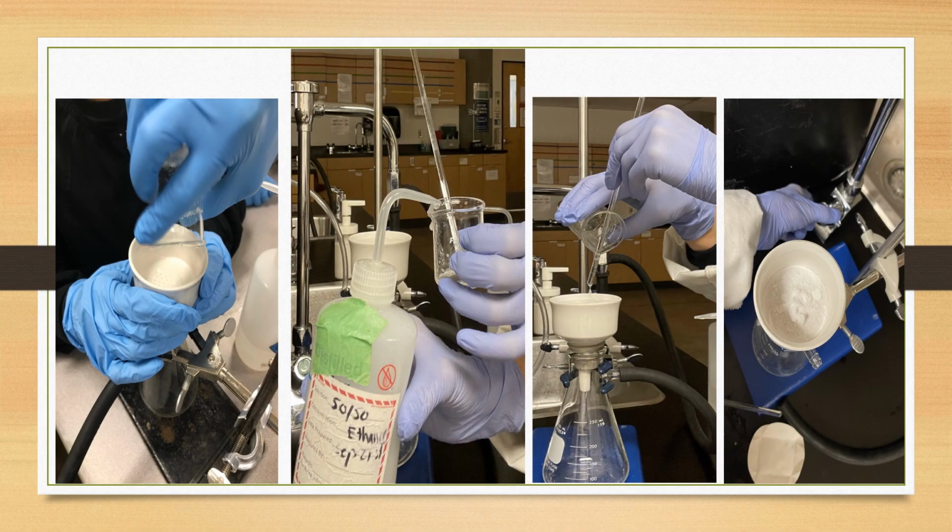Collect the alum crystals by vacuum filtration using a Buchner funnel. Use a few ml of 50-50 ethanol water mixture to rinse the beaker, then pour it over the crystals inside the funnel. To turn off the vacuum, first disconnect the tubing from the Buchner flask, then shut off the water.